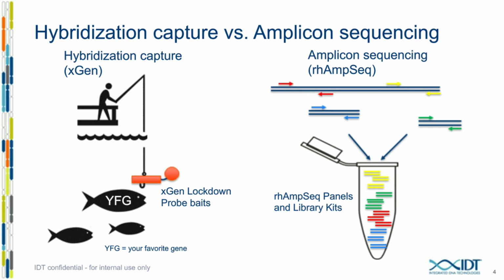There are some advantages to using amplicon sequencing. The workflow is very easy. It's just 2 PCRs, so there are fewer steps. There's no need for DNA shearing. It's better suited to smaller target panels. Again, because it is just 2 PCRs, it is very easy to adapt to automation. And because we're using a pair of primers to enrich for a particular target, it generally has a higher on-target rate. Some of the disadvantages are that ultra-low allele frequency detection is not quite proven.